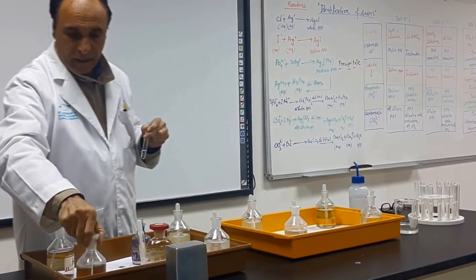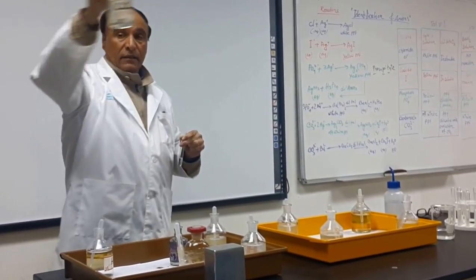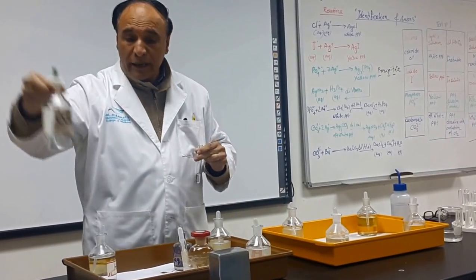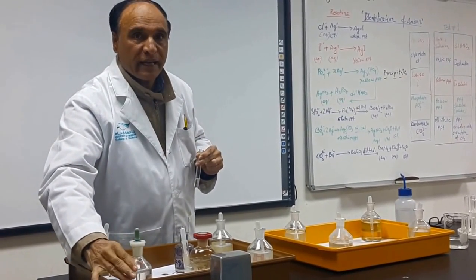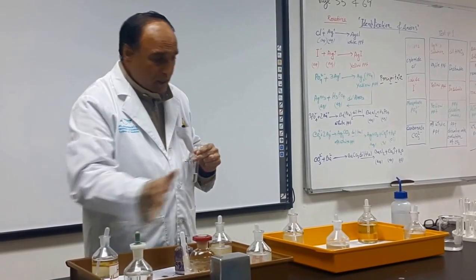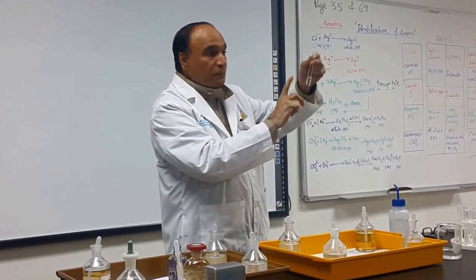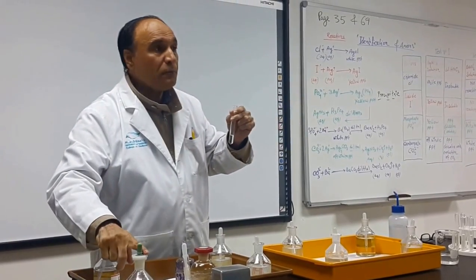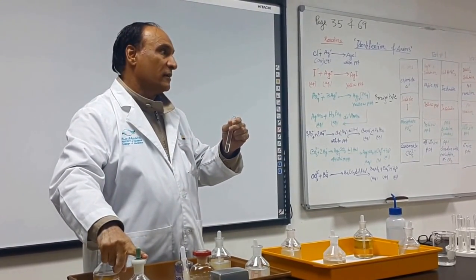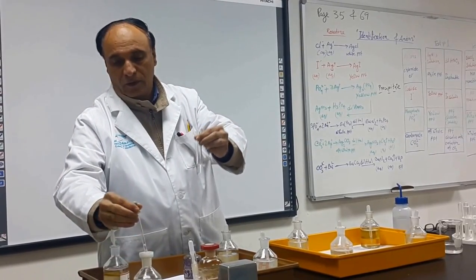Then I put carbon tetrachloride. This is carbon tetrachloride, CCl4. This is an organic solvent. This is organic, and this is non-polar. All these solutions are in water, so they are polar. So this is polar, this is non-polar. They don't like each other. So they will not dissolve.